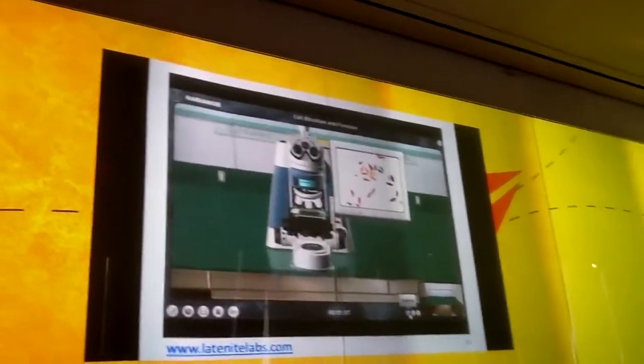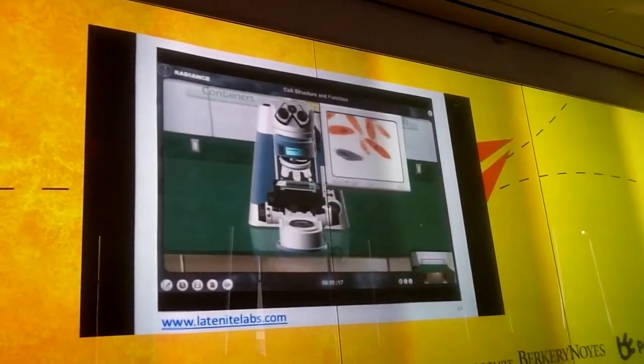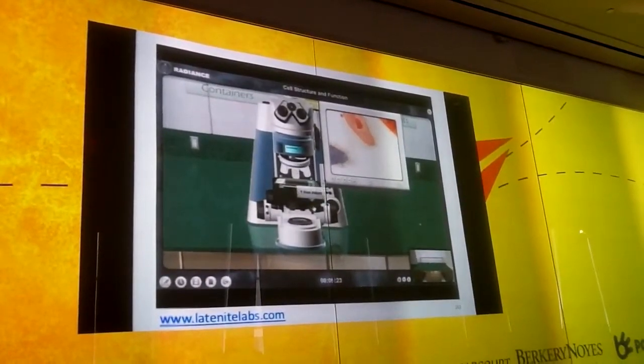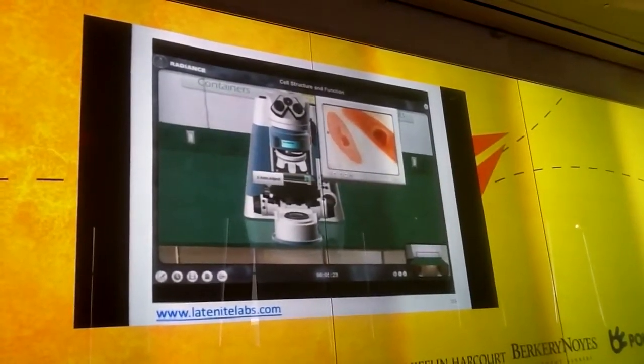Paramecium slide that's been loaded onto our microscope. These are real digitized histology slides, and the microscope is something that the students will be able to use and learn about microscopy. We zoom in, we can look at, this is paramecium, everyone's favorite small organism, paramecium. You can even see the pieces of cilia surrounding the actual paramecia.